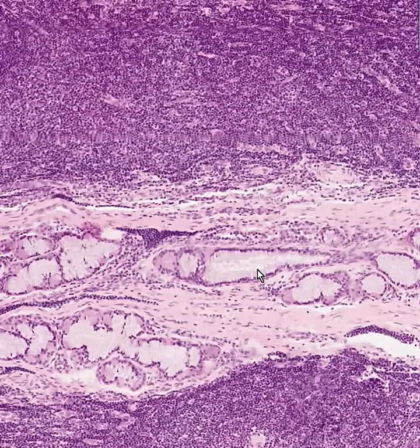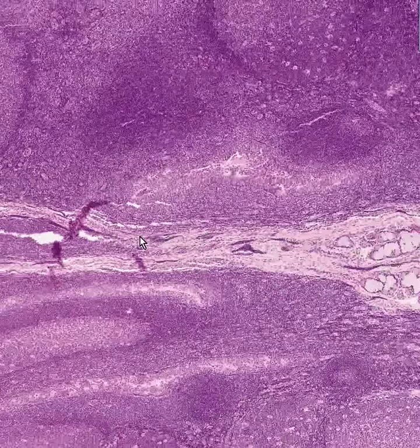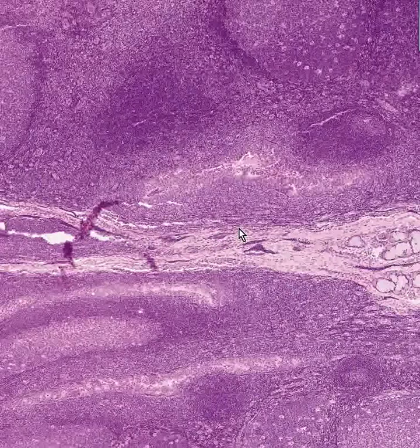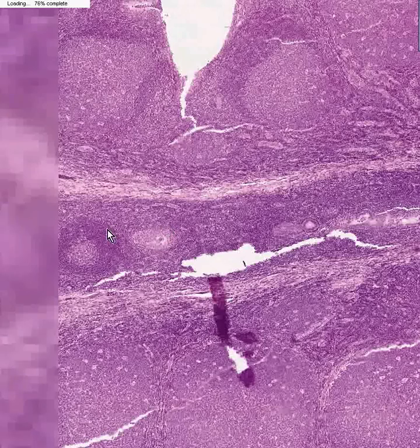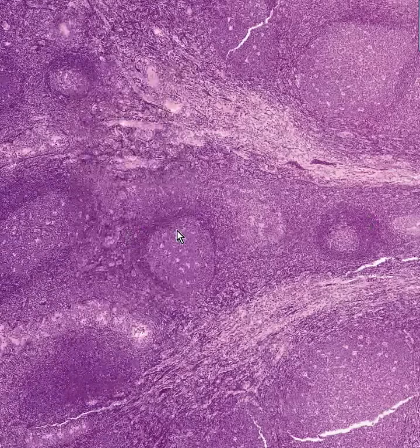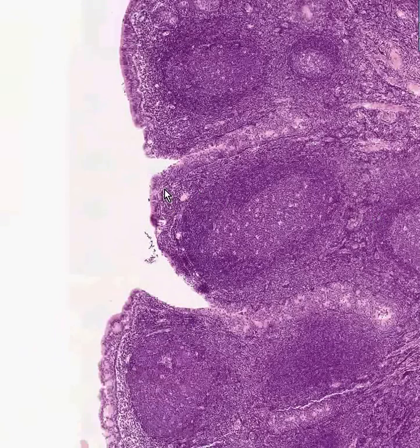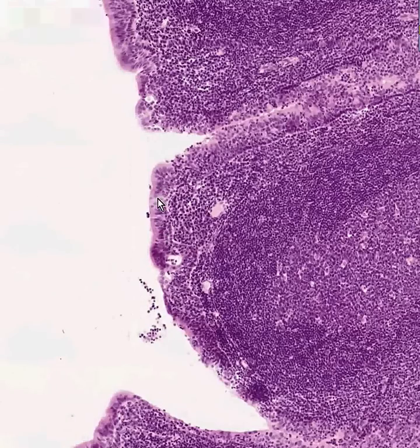We know that they are not palatine tonsils because they don't have squamous-lined crypts. But what they do have at the periphery is some type of mucosa, and it is really not squamous — it's columnar.